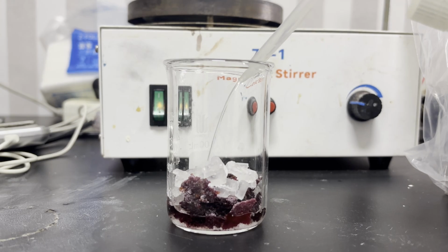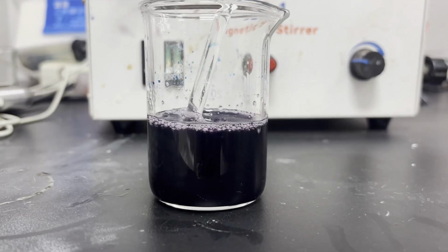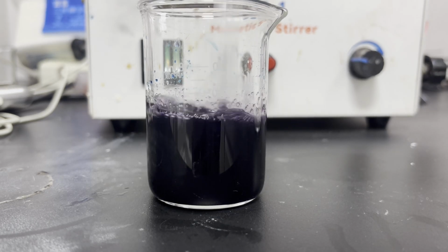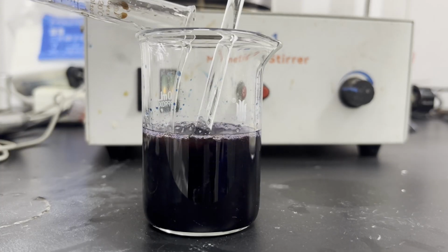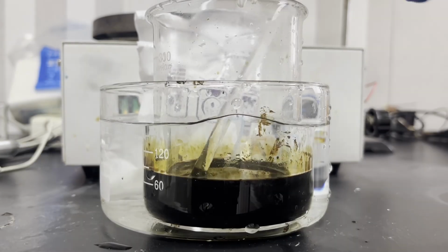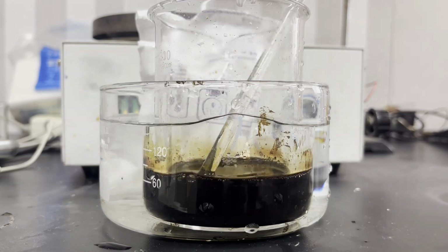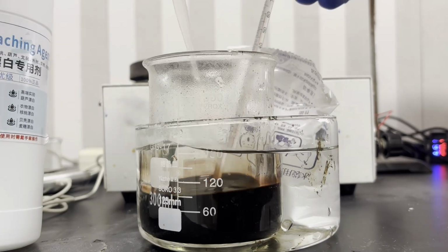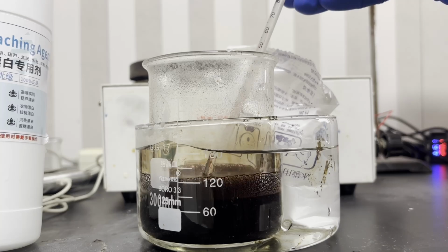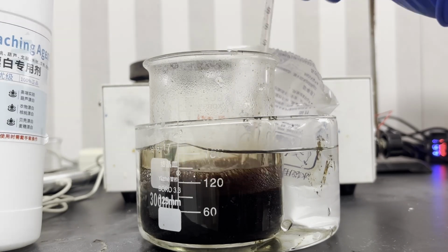I dissolved 10 grams of cobalt chloride hexahydrate in 50 ml of water and added 2.4 grams of ammonium chloride, 12 grams of sodium thiosulfate pentahydrate, and 50 ml of ammonia. Finally, I make up the volume with water until 80 ml. Under an ice bath, I dropwise added 30% hydrogen peroxide until I saw the color change to a deep red-purple. The temperature shot up to 60 degrees C at the end of the addition, which should be avoided with care as the thiosulfate complex is sensitive to temperature.